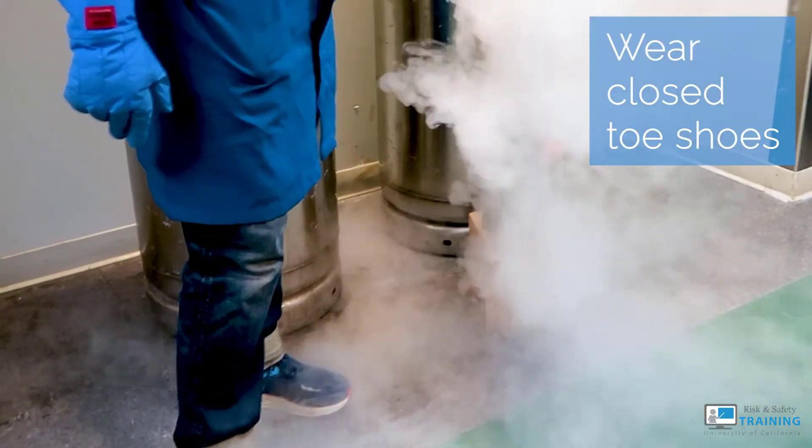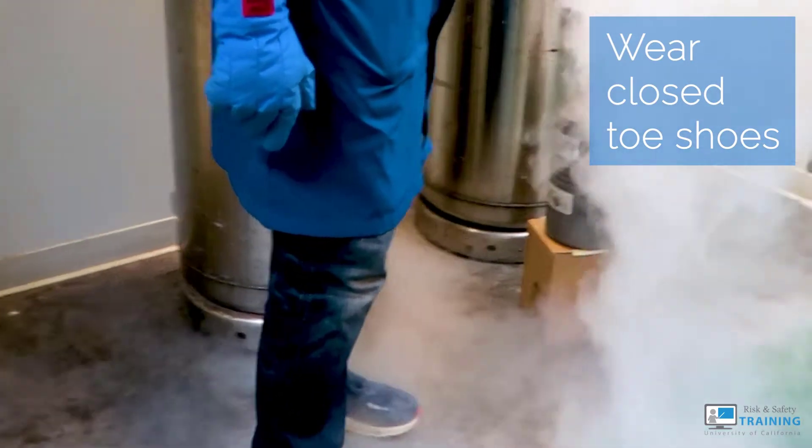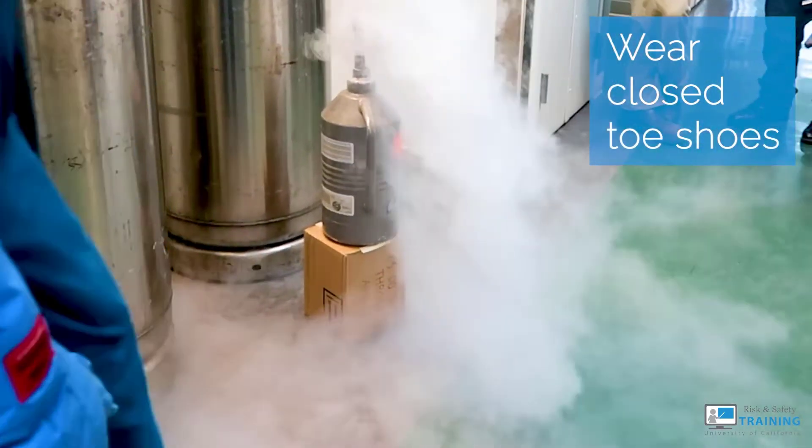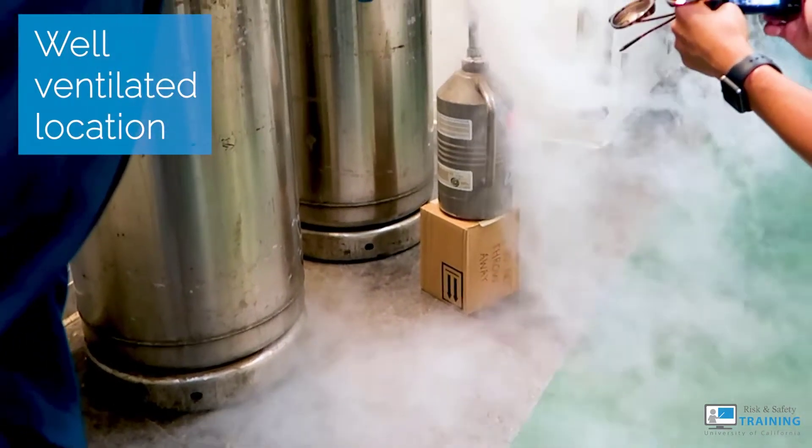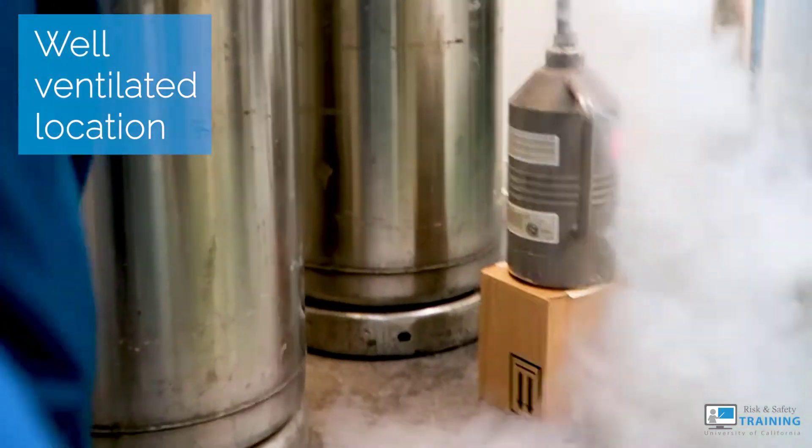This is why you wear face shields and safety glasses to protect your eyes, and solid shoes, because cold liquid and vapors will splash onto your feet. This is also why you need a well-ventilated space, because the vapors expand at a quicker rate than the size of the liquid.